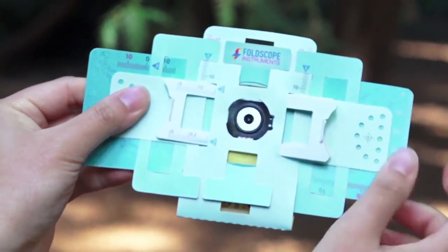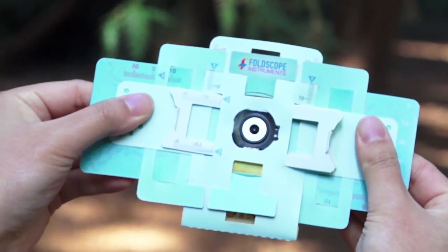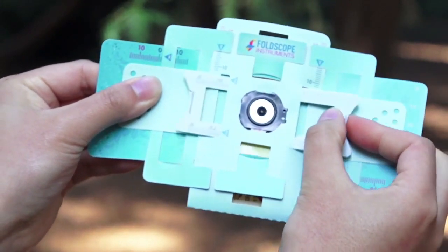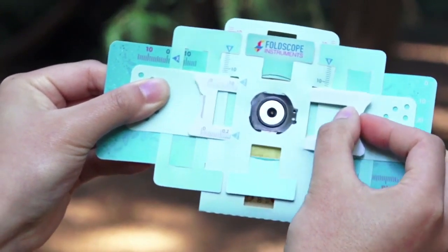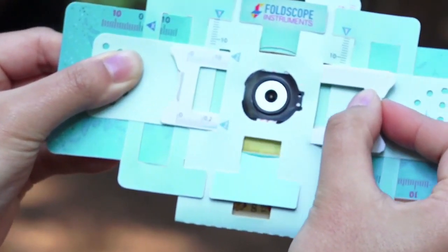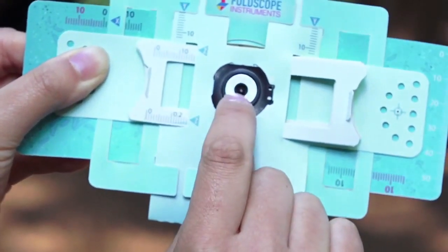What it's doing is it's moving the lens. To focus your image, you can slide your focus ramp side to side like this using your dominant hand. I'm right handed so I'm using my right hand right now. Do these motions while you're looking straight into the lens.